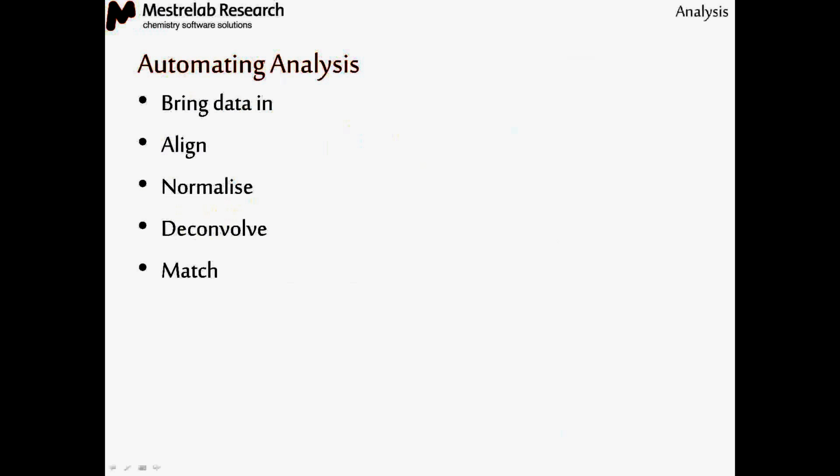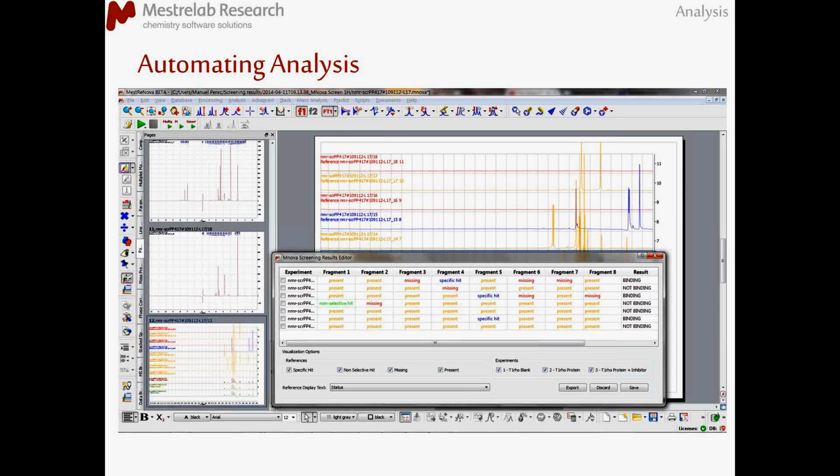And our last step would be to get all those results and produce a report. This type of report will come in 2 different ways. It will come as a visual inspection, and as we will see later on, it will come as well in what we can call a report in an Excel format that we can play with more later on.